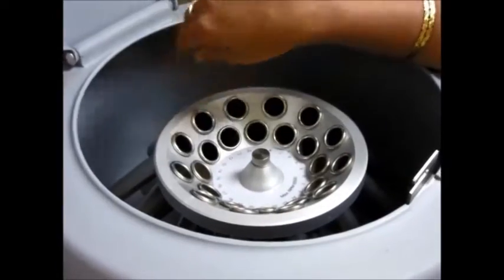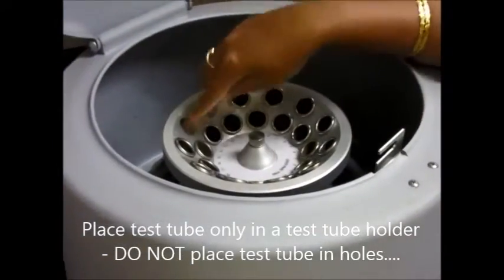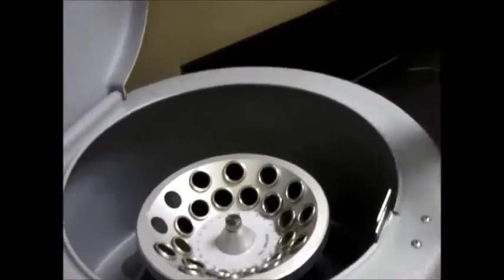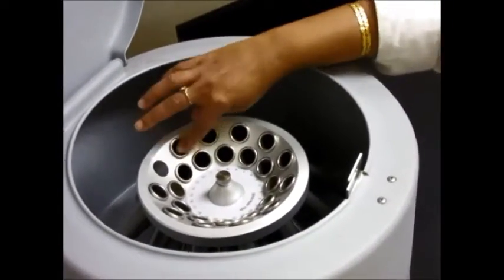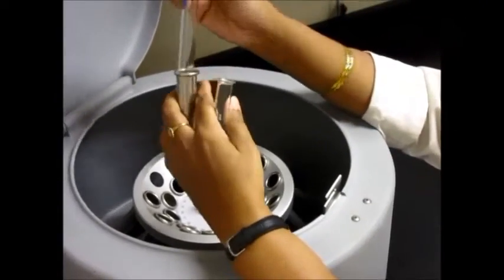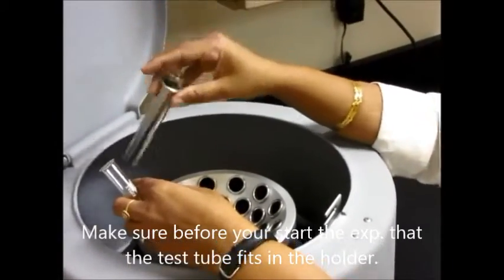You will have test tube holders in there. Please remember that in some cases you may just have holes in the centrifuge — we do not place test tubes directly in those holes. Please make sure that you have a test tube holder in one of these test tube spots to hold your test tube. Also make sure your test tube will actually fit inside the test tube holder, because if it doesn't, you cannot use the centrifuge.